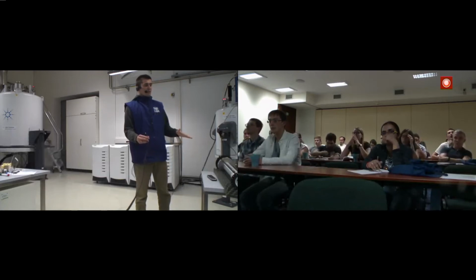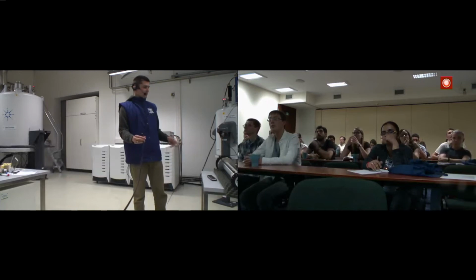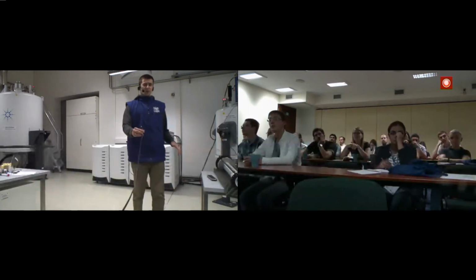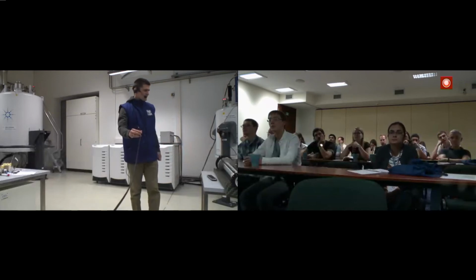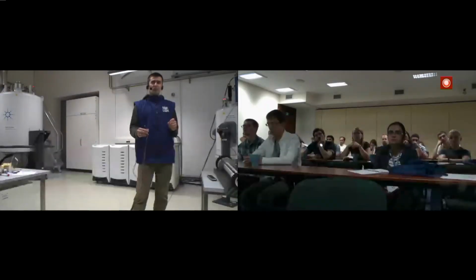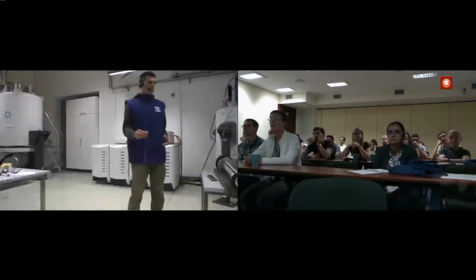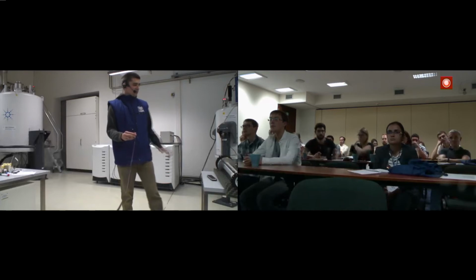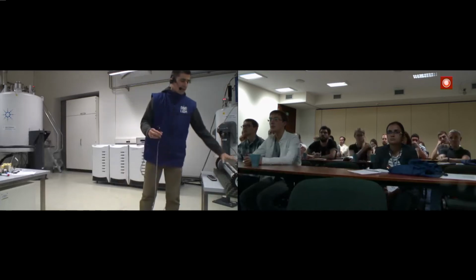I would like to show you several features of that probe head, because we have two different probe heads which are very, very similar. One of them has rotors which are 4 millimeters in diameter, and the other one has slightly larger rotors, 6 millimeters in diameter. And the latter one I have over here.